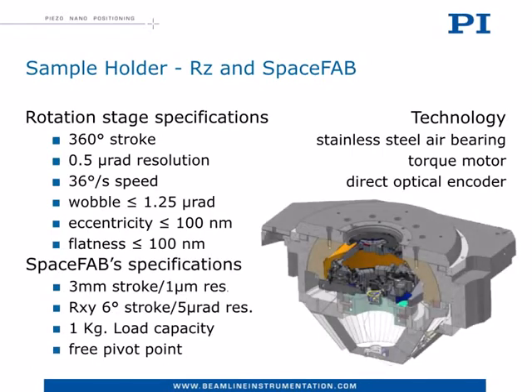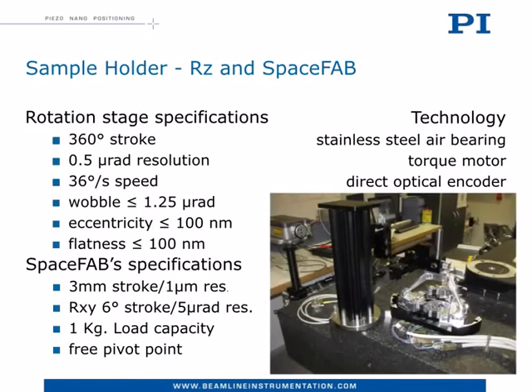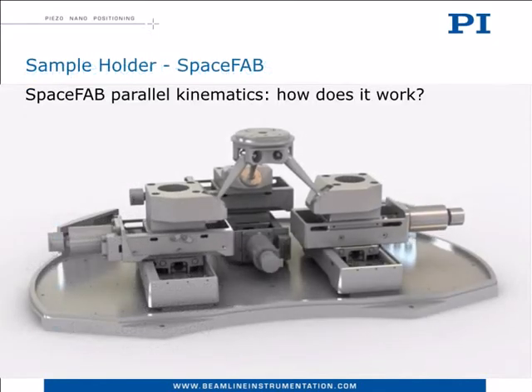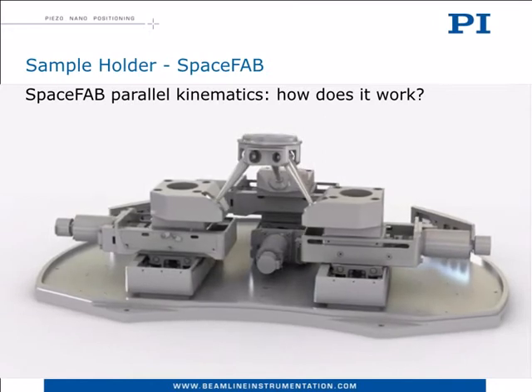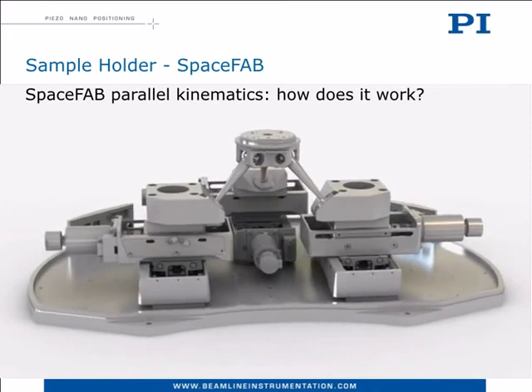In order to make the user's life easy, we integrated into the moving platform a 6 degrees of freedom SpaceFab robot. In this way, the researcher can simply drop the sample on the rotation stage and align it to the beam afterward by playing with a user-friendly software, without the need of any expensive accurate toolings. This 3D animation shows how a SpaceFab converts the linear motion of three XY linear stages into 6 degrees of freedom of the moving platform with an arbitrary pivot point in space.